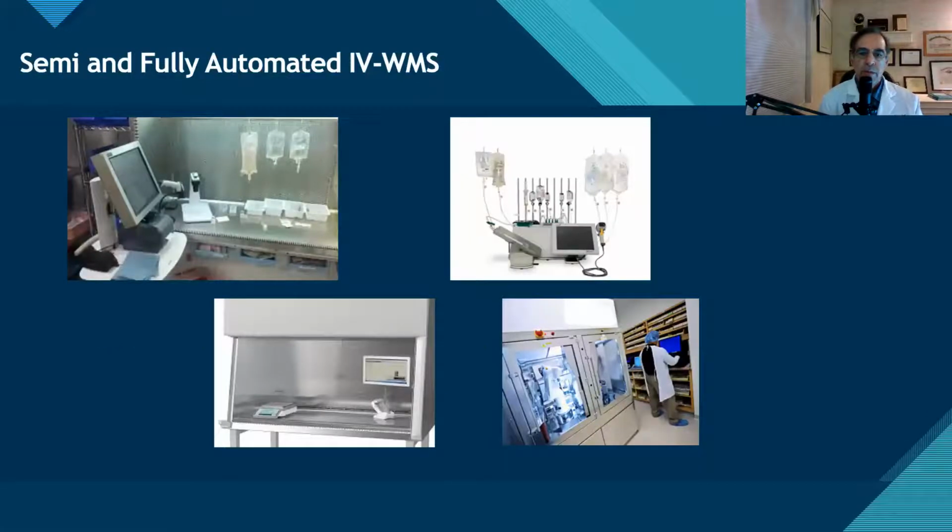Now with IV workflow management systems, we avoid a lot of these issues. And probably the best part of it is we don't have to rely on the syringe pullback method to verify the amount of drug that has gone into the solution.